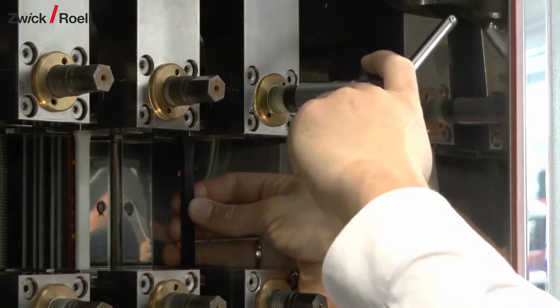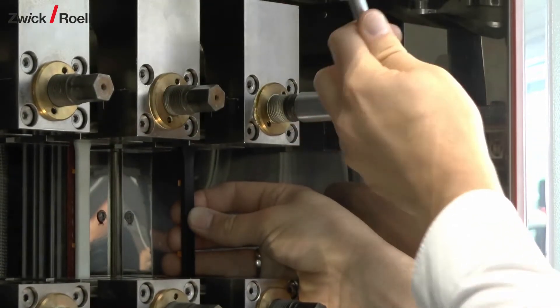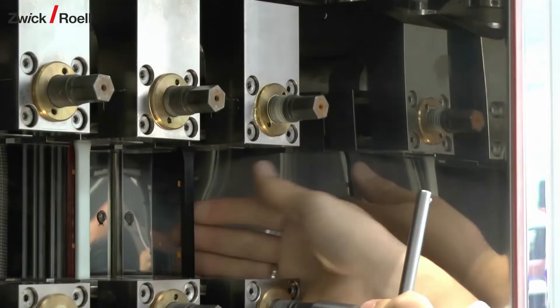Specially adapted mechanical grips, optimized for use in environments with high humidity, allow easy and fast specimen exchange.